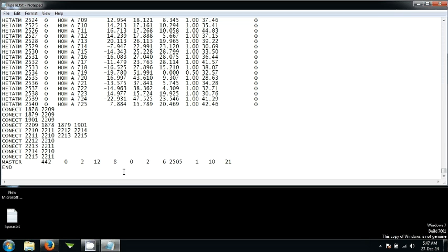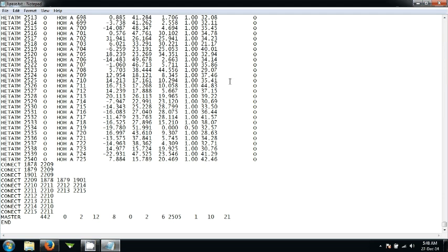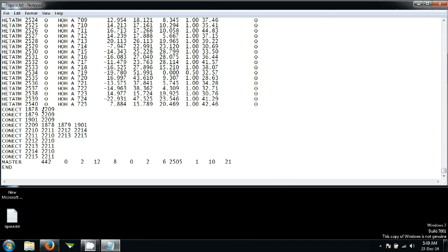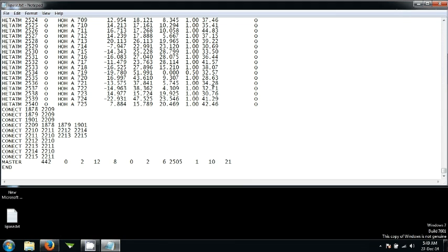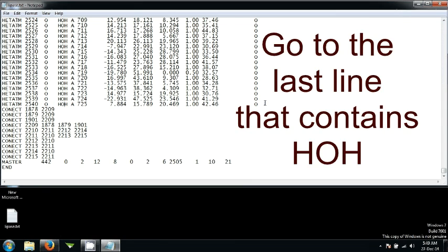Before you exit, there is one thing that you need to do and that is you need to remove these H2O molecules. Just go ahead and find this thing that says HOH. This means we need to remove this line. In order to do that, go to the end of this line.